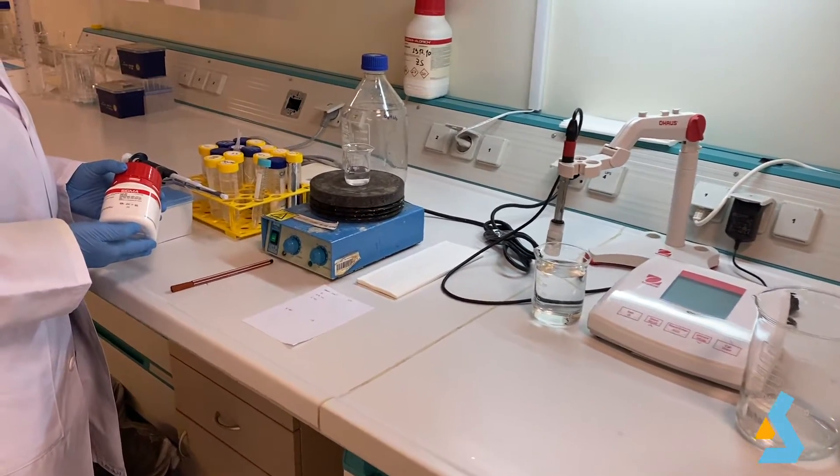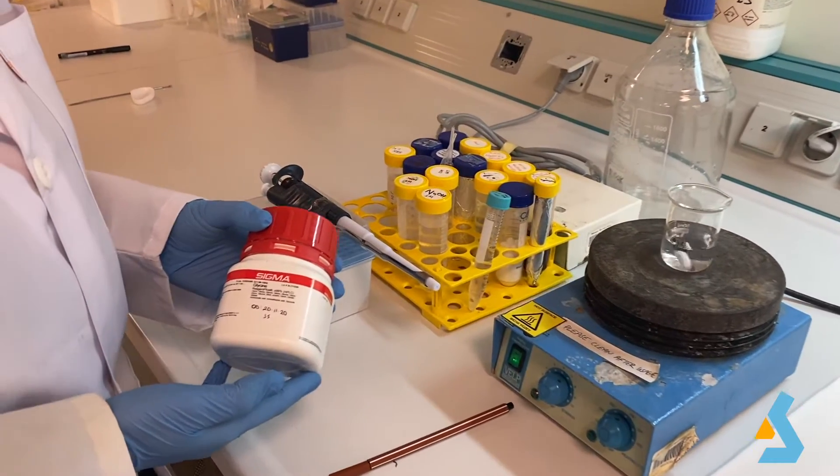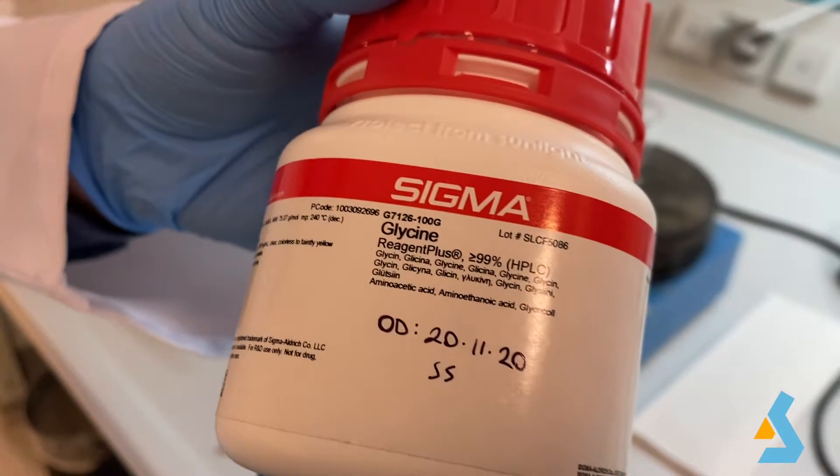Now, we will show you how to plot a titration curve to identify amino acids based on their pKa values. In this video, the amino acid we used was glycine.